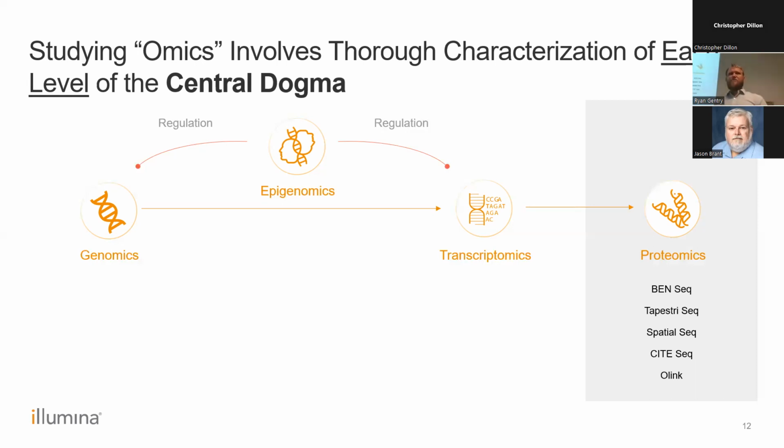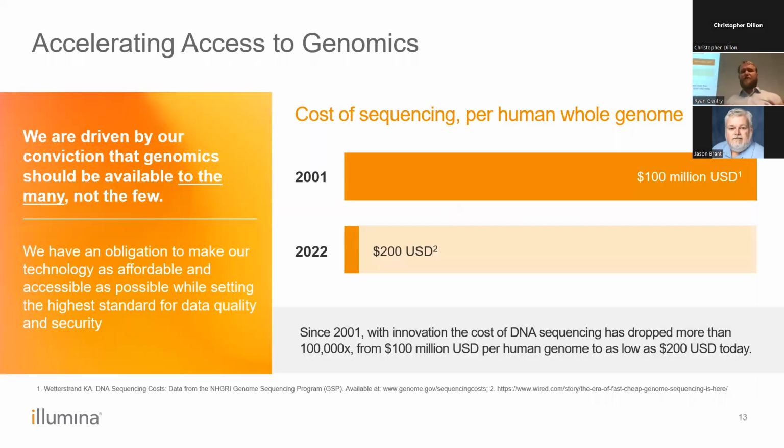What we want to do specifically with this talk today is show you how we can do multi-omic approaches, so using more than one of these approaches to get to the answer that we're looking for in understanding our cancers. Why are we looking at multi-omic approaches recently? Before, we didn't do it because it was really expensive, and sequencing still is expensive, but it's getting a lot cheaper. You can see that there's a lot of companies moving into the market, and that helps the consumers. It helps you all because it drives down the prices.